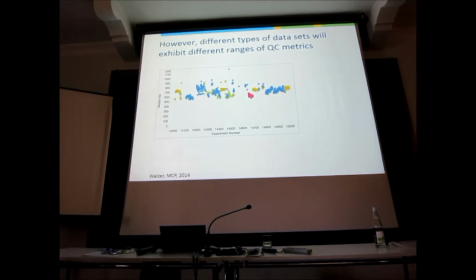And what you can see is that the protocols, which all have different colors, have different outputs. Yeah? And it really depends on the protocol more than anything else. So the way that you do your experiments necessarily influences the way your data looks. So you need to keep track of this kind of stuff, otherwise your variance will be very big.